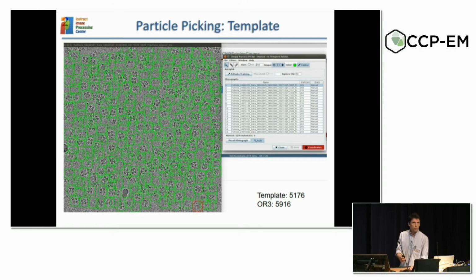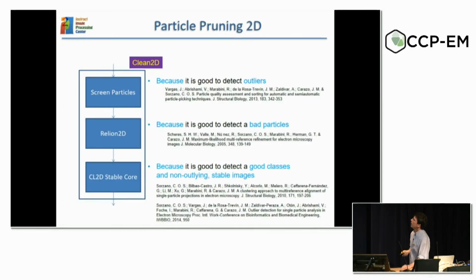So I believe a particle is a particle if it has been found by anyone. And then probably you end up with many more coordinates than particles. So you have to decide later what is a particle and what is not really a particle. It is simply some background point or in the middle of two particles, etc.